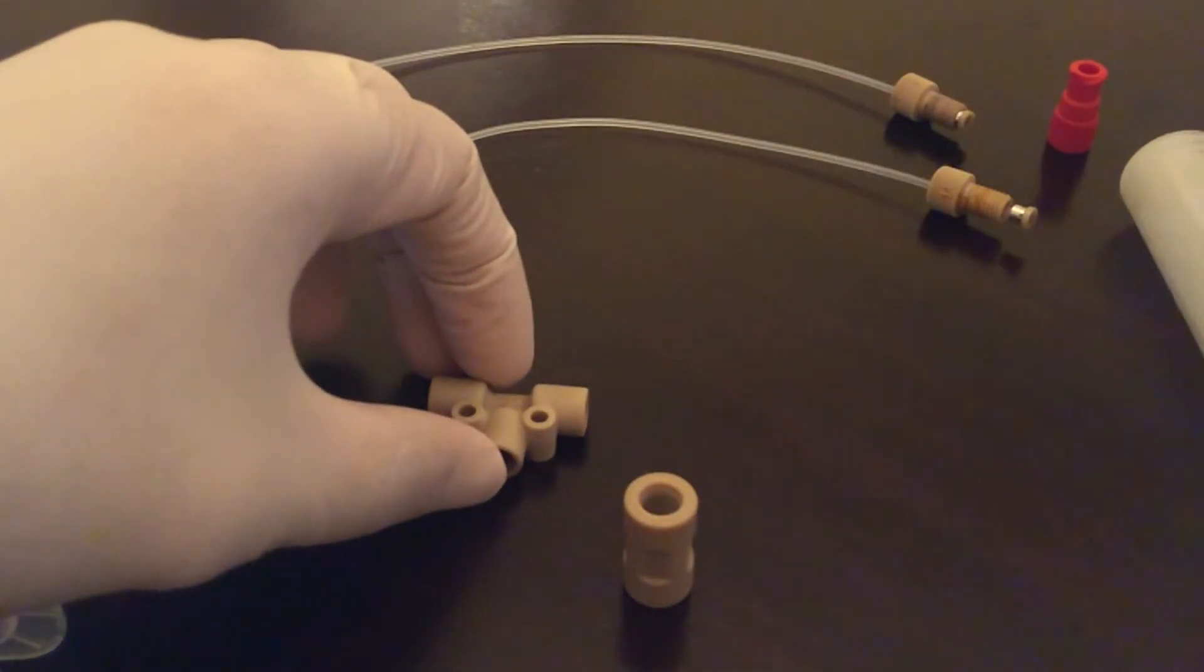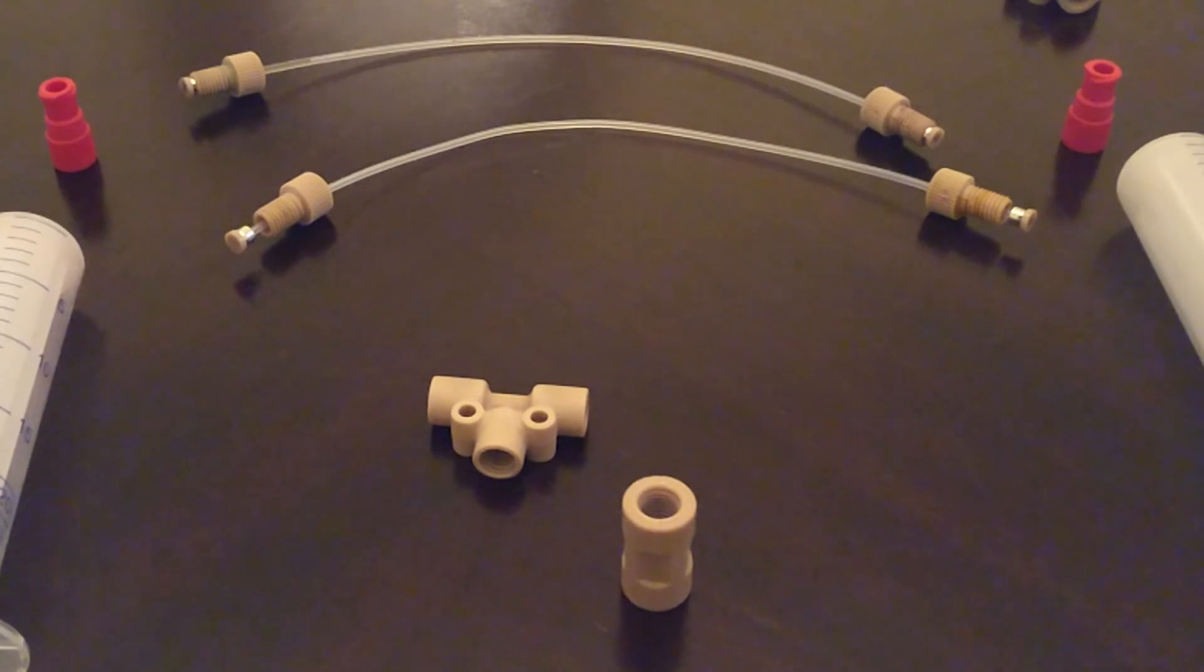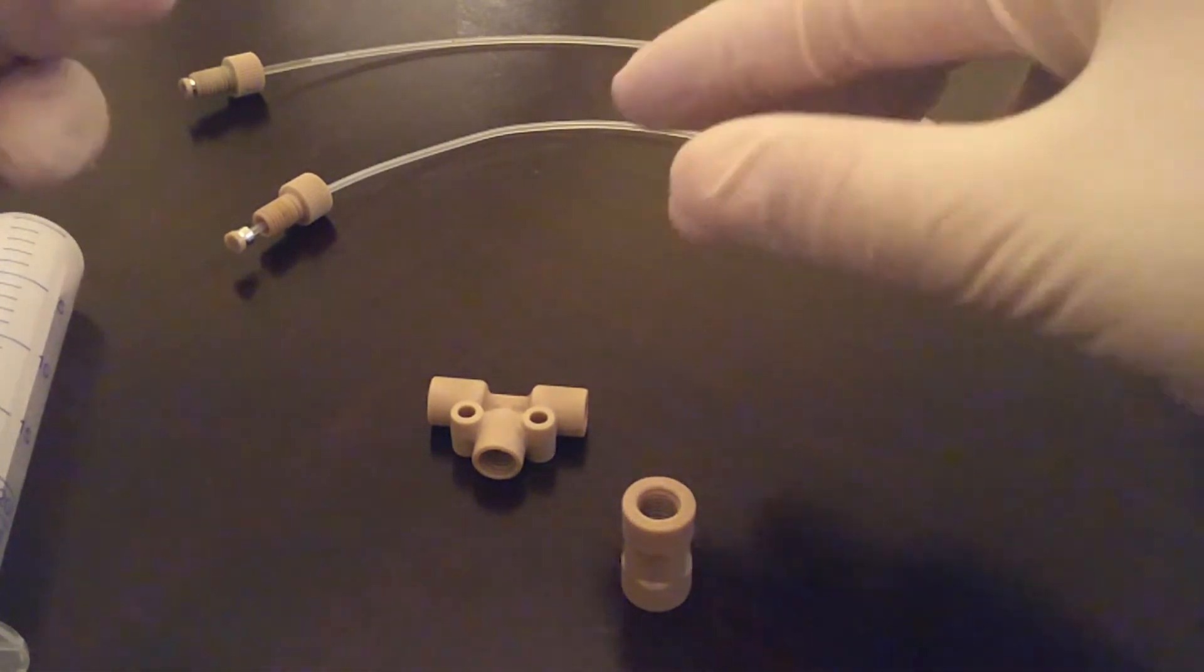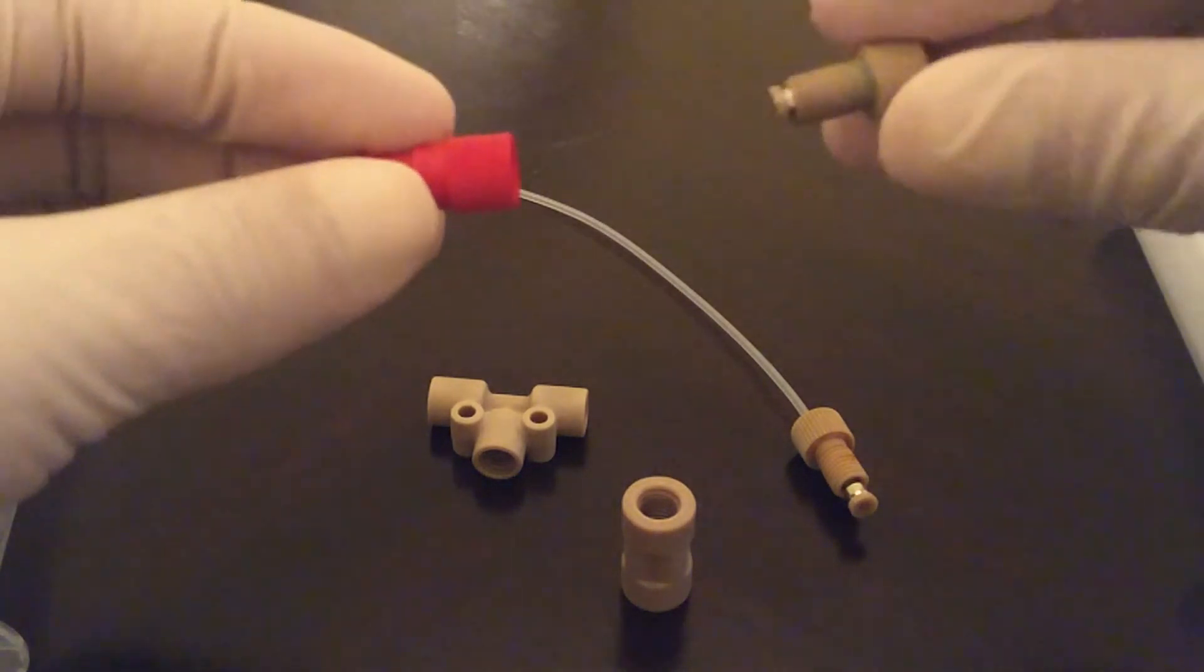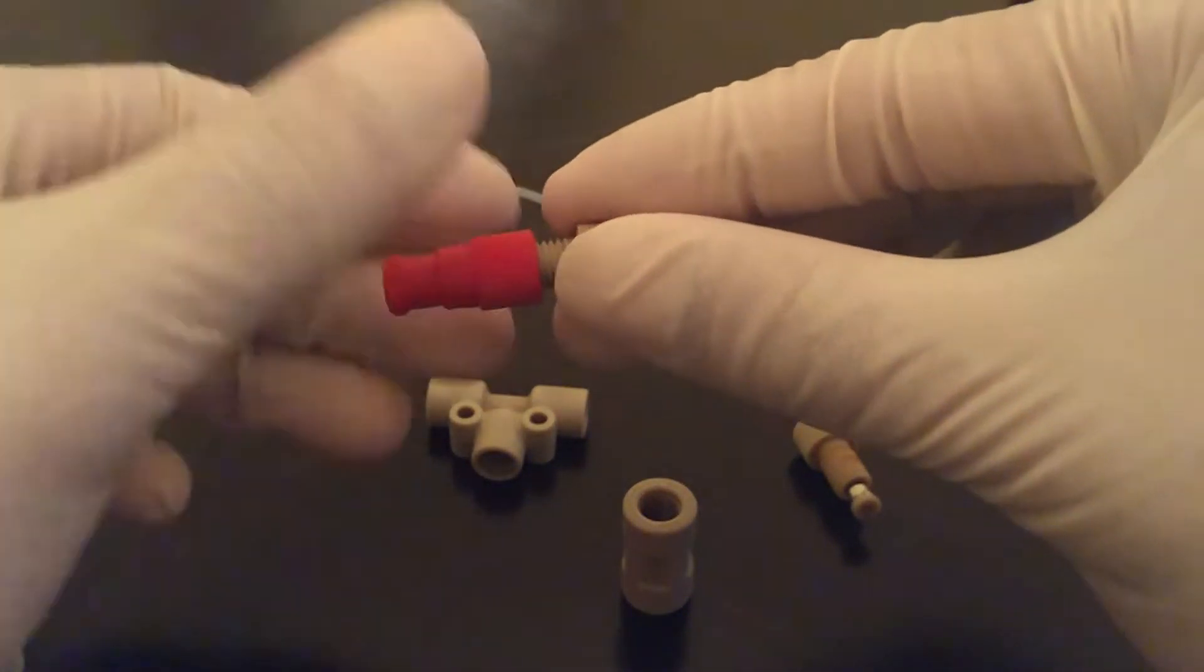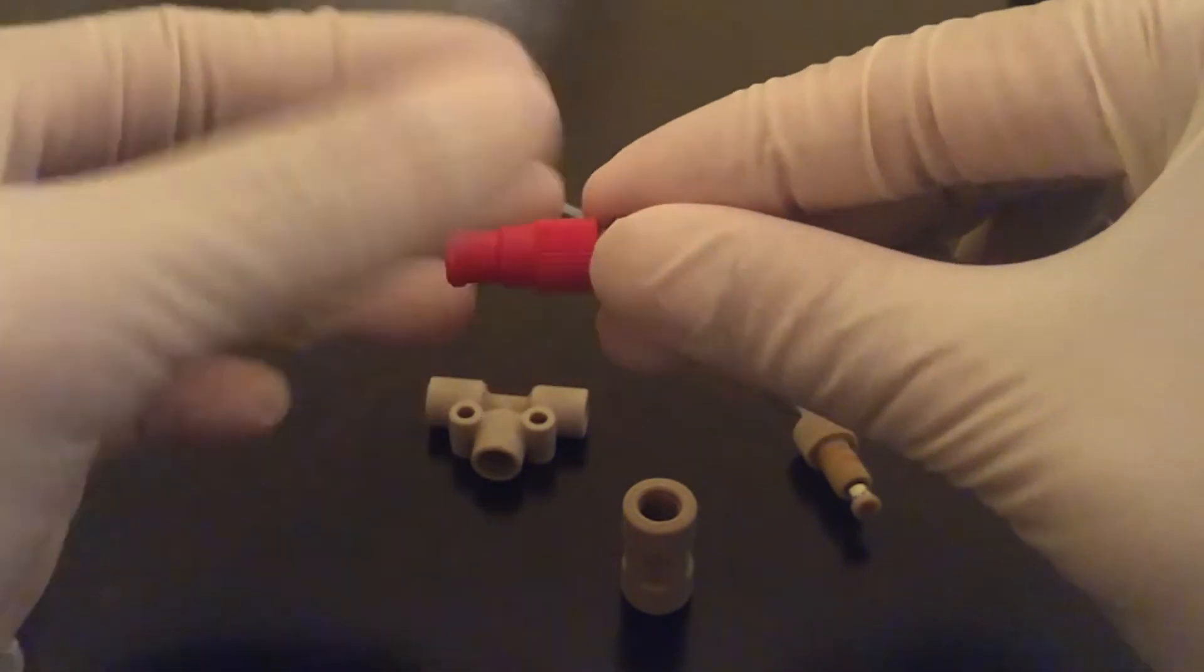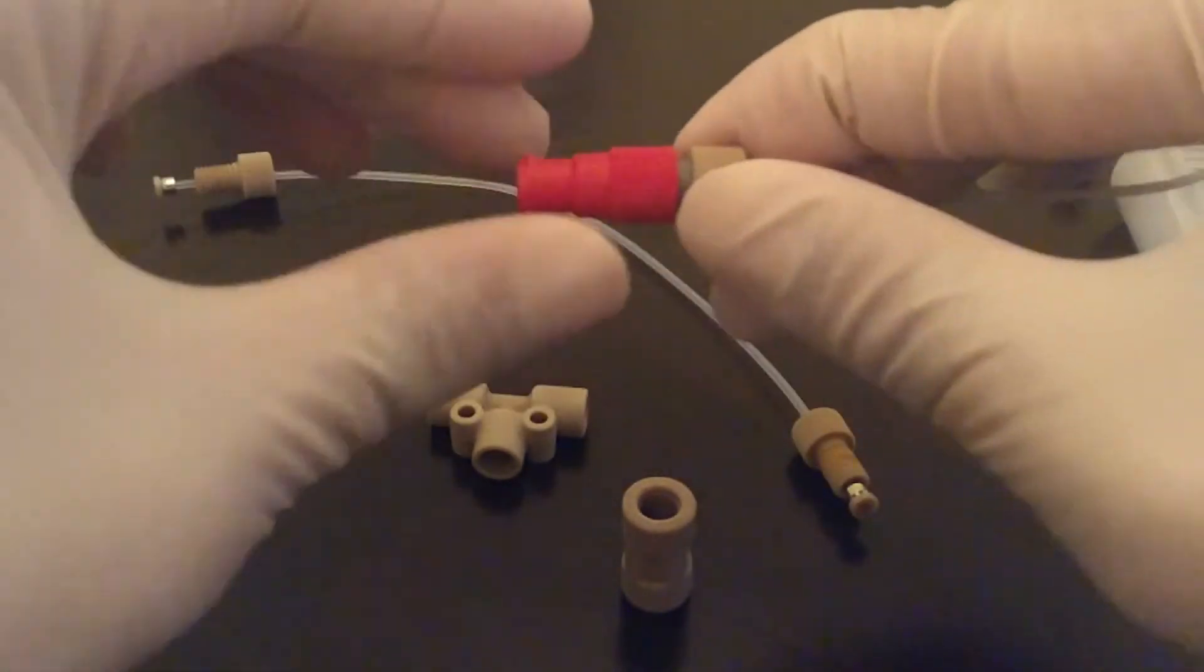We recommend using a connector that uses a Luer lock for syringe and screw system to link to the flow system. This will enable a very tight and strong connection. We recommend part P-678 red or P-628 colorless.